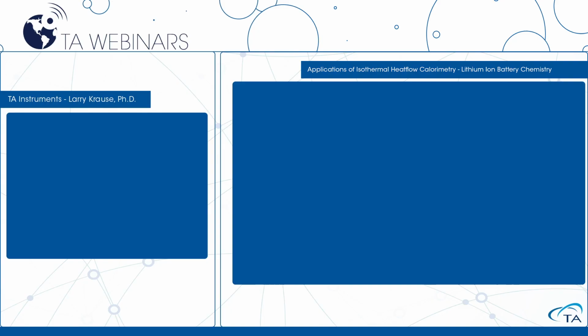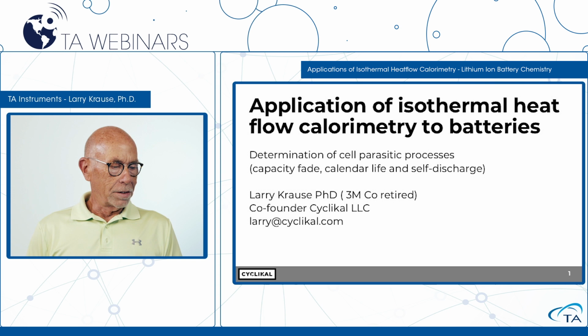Larry? Well, thanks a lot, Colette, for the introduction. I'm going to talk today about isothermal heat flow calorimetry, specifically as it's applied to batteries. I worked at 3M for 36 years. About 30 years of that was in materials development for lithium-ion batteries.